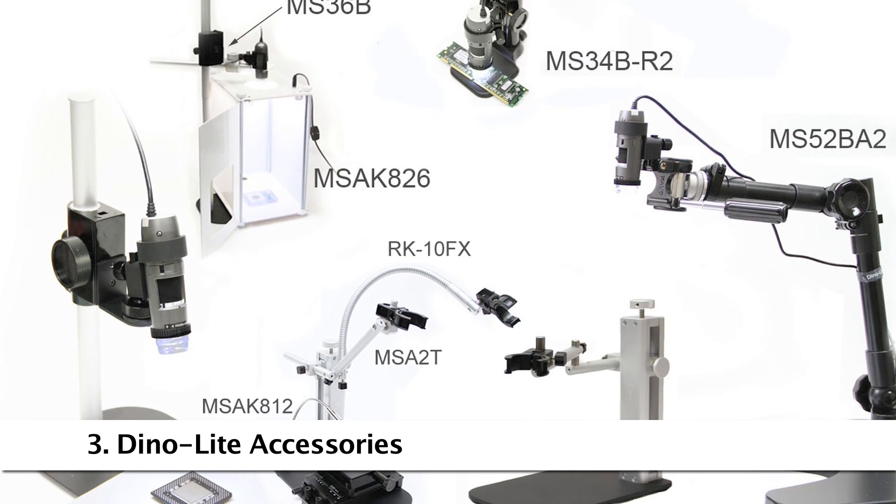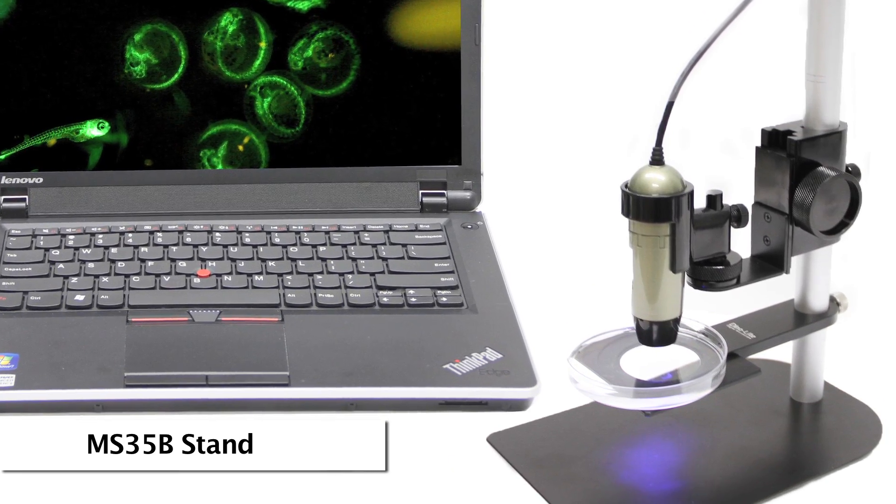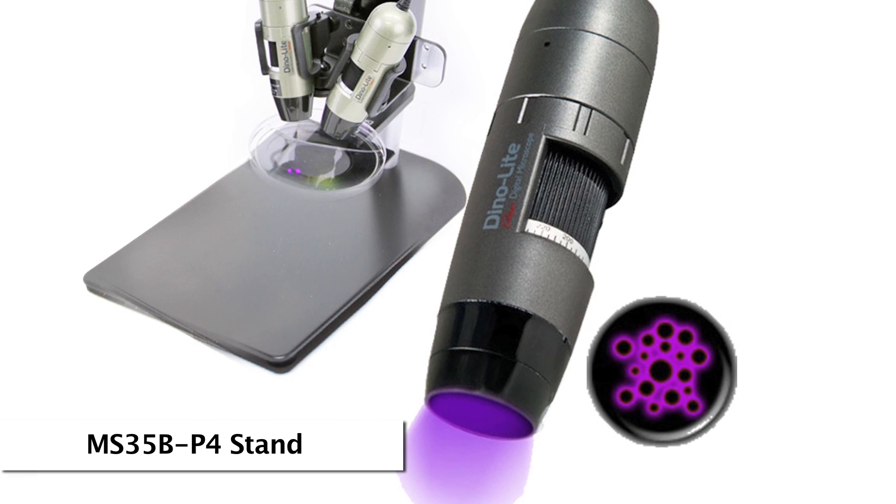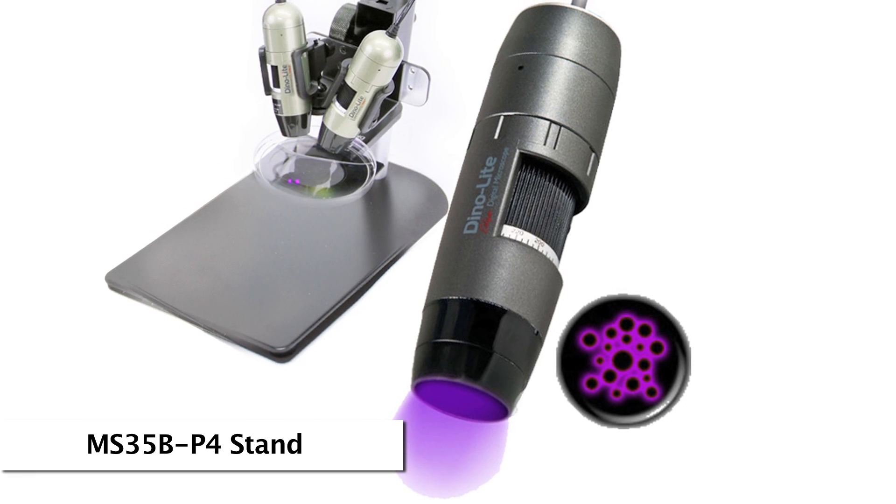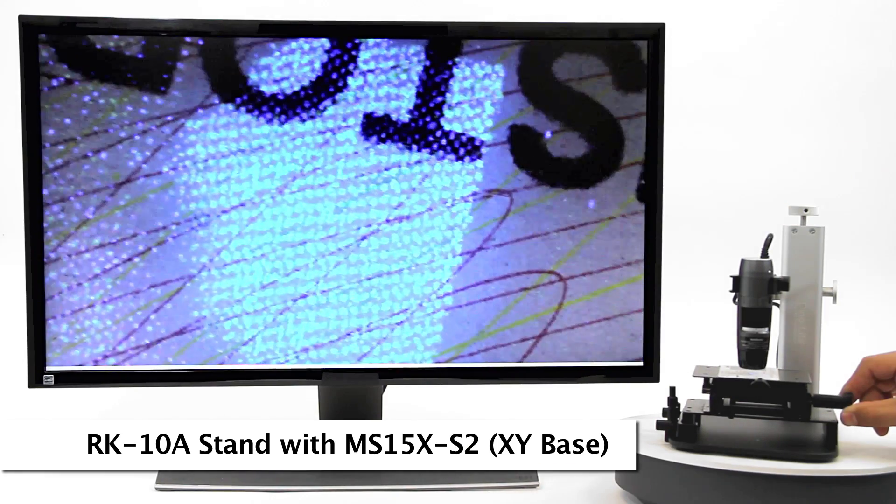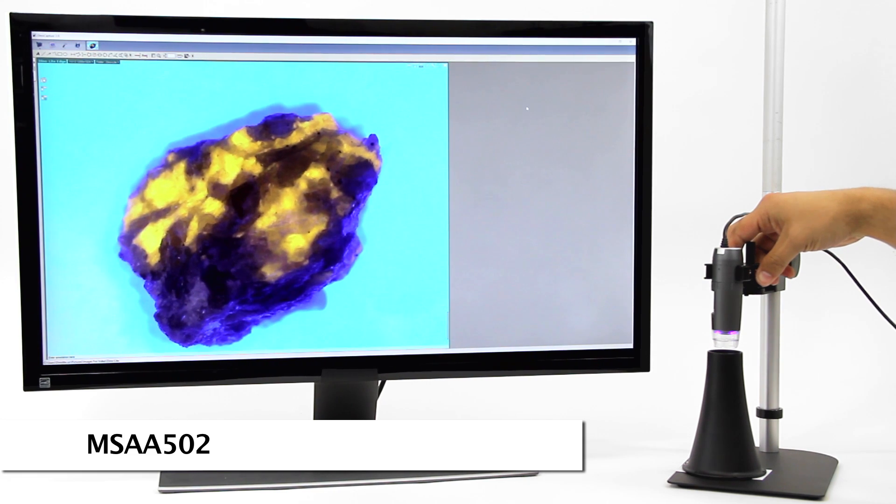Here are some recommended compatible accessories. The MS35B is a tabletop stand with fine adjustment. The MS35B P4 version is modified for dual comparison. The RK10A features a fine adjustment knob and a quick release button. The MSAA502 is great for eliminating outside light.